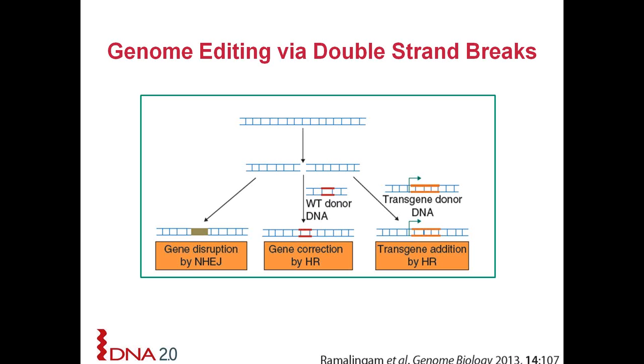So the next question is, how long does the homologous recombination overlap sequences need to be? Again, that homologous recombination sequence length depends on the host of interest. So some hosts like E. coli are not great with recombination on their own. So you need to provide 500 bp to 1 kb at least of homology on either side. If you are able to do it with the recombineering enzymes or lambda phage enzymes, you can do it with shorter 40 base pair sequences.